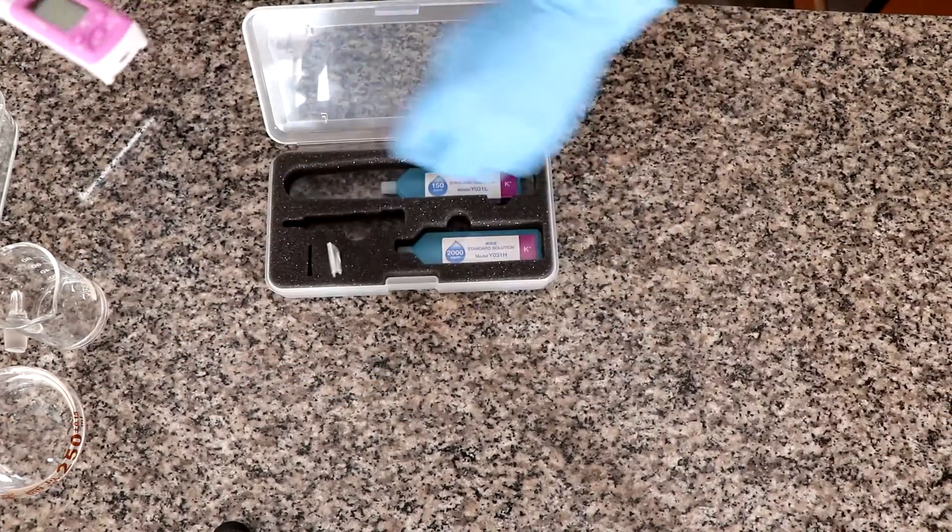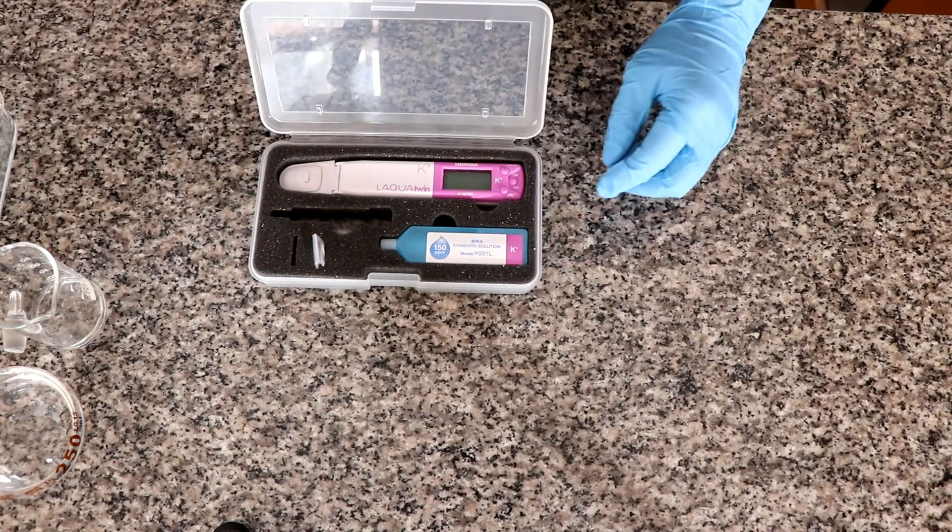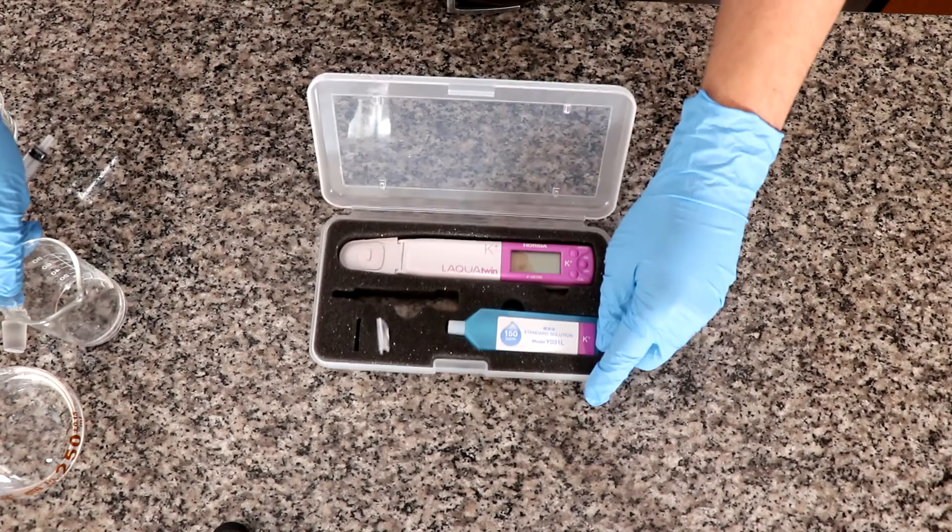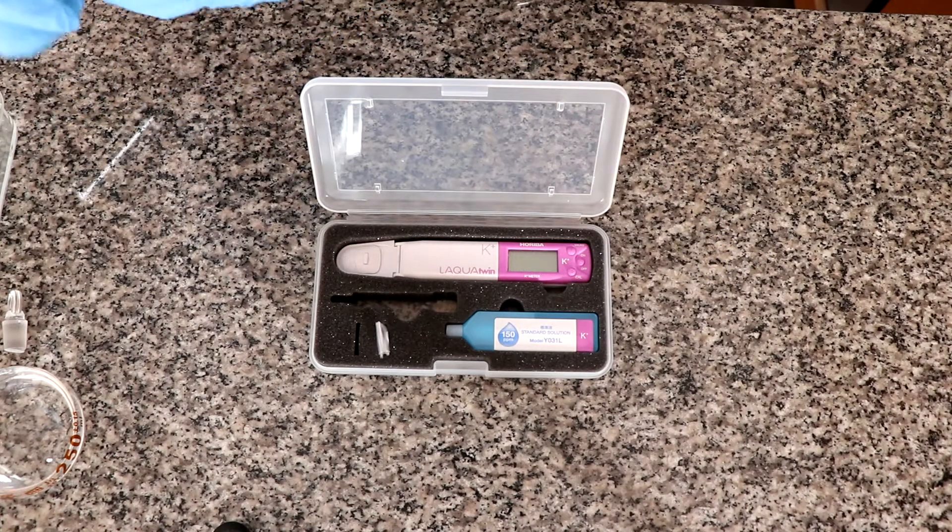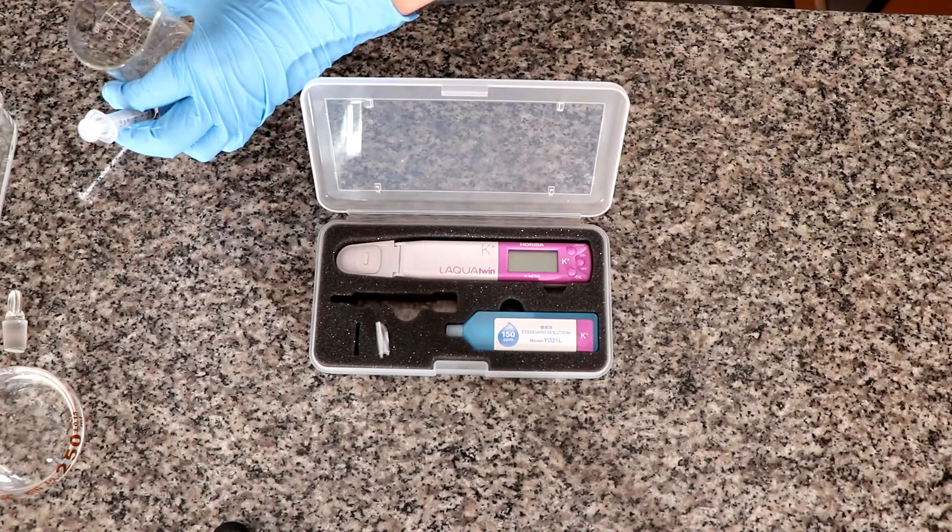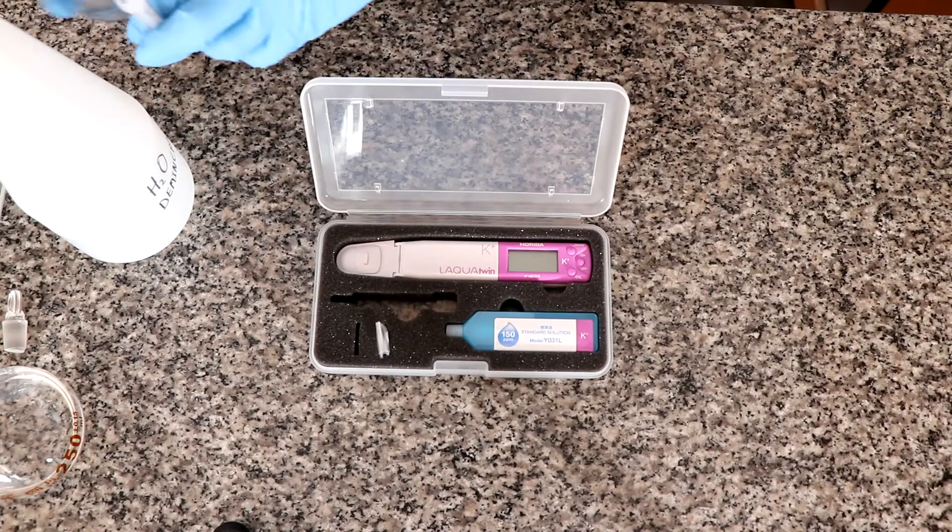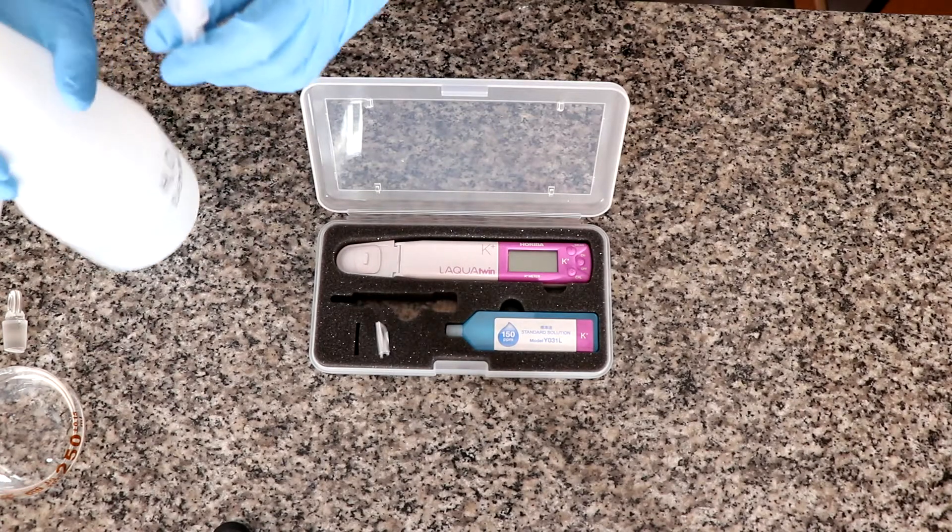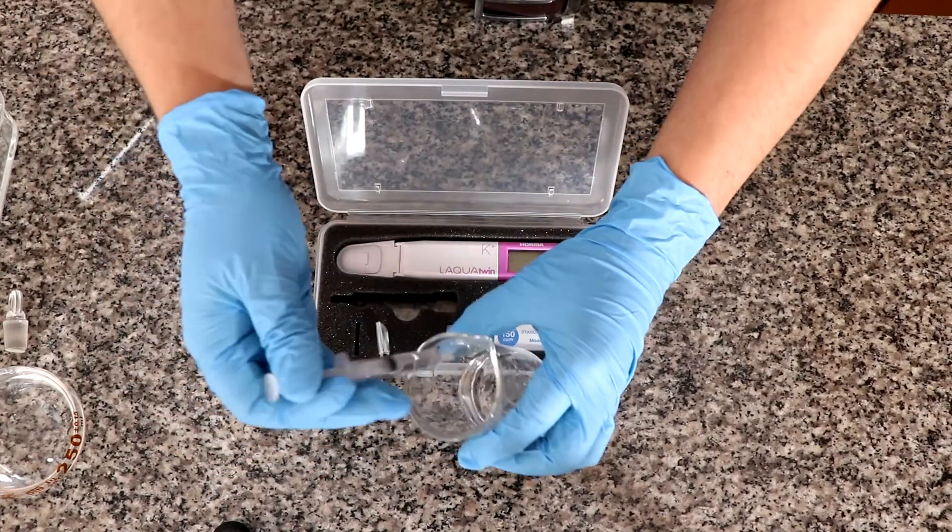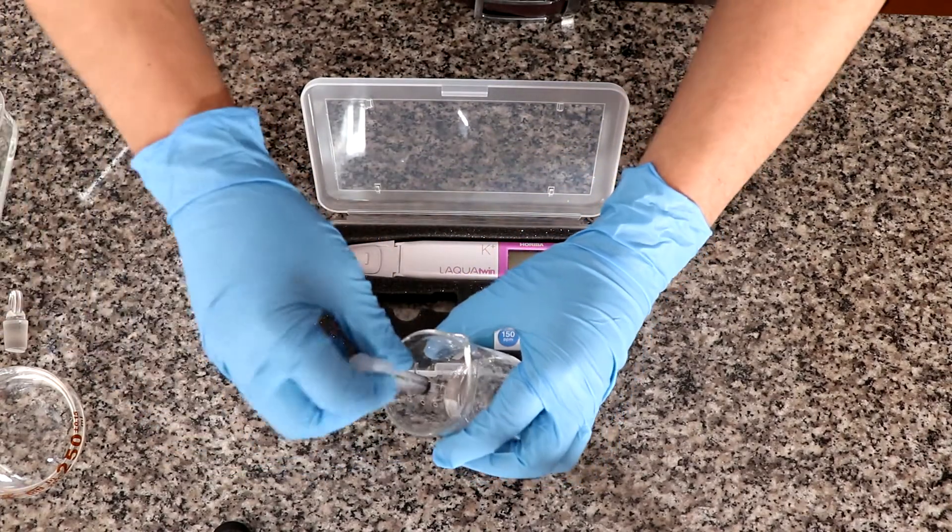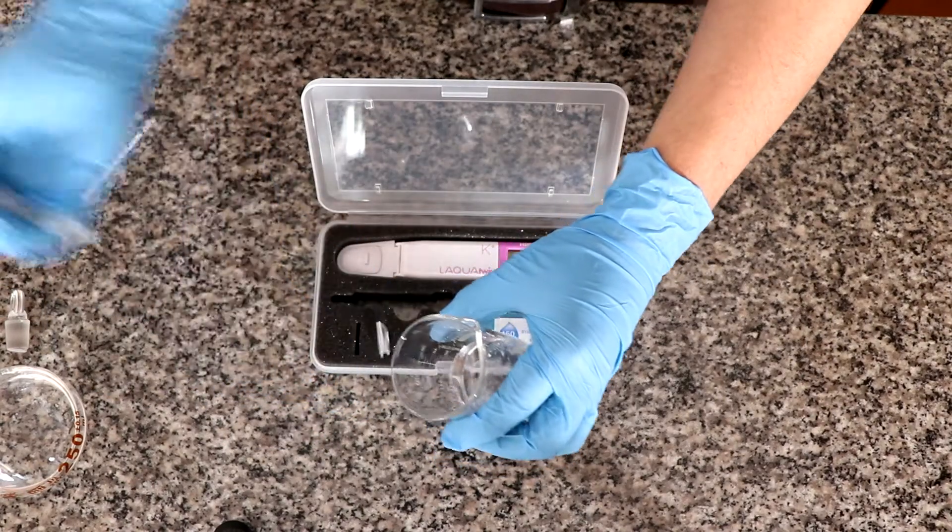So in order to store this, you will store your two calibrating solutions here. You store your electrode here. I am going to just make sure whenever you use the syringe that you later purge it with distilled water so that you don't carry anything from past measurements into your future measurements.